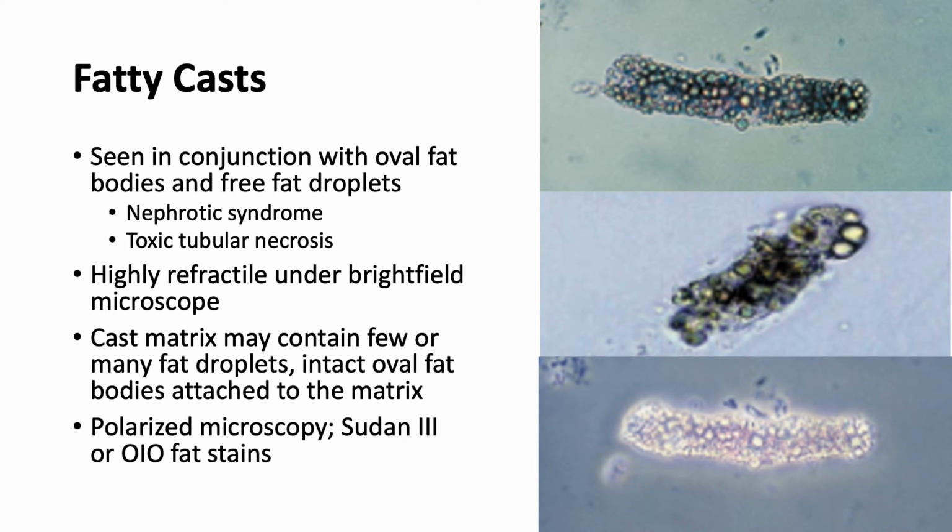Cholesterol tends to exhibit a Maltese cross formation under polarized microscopy. Triglycerides and neutral fats stain orange-red with fat stains. However, the fats do not stain with the Sternheimer-Malbin stain.